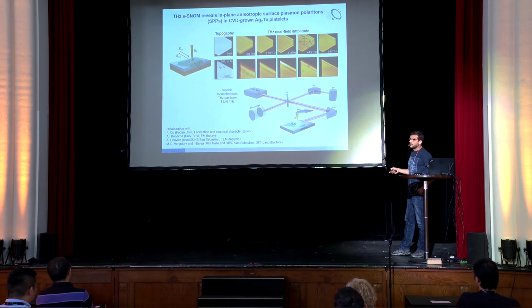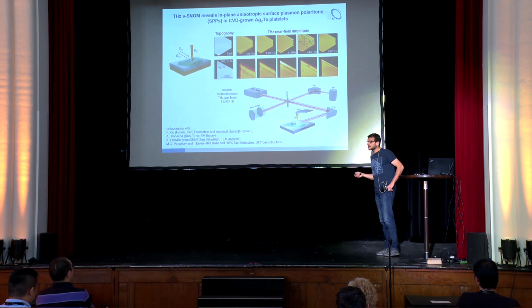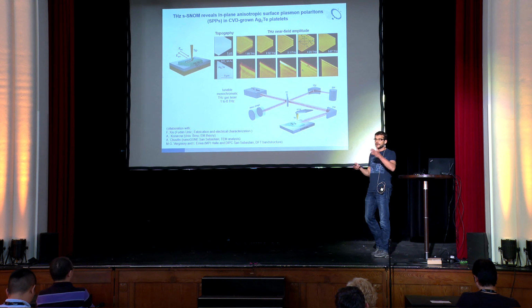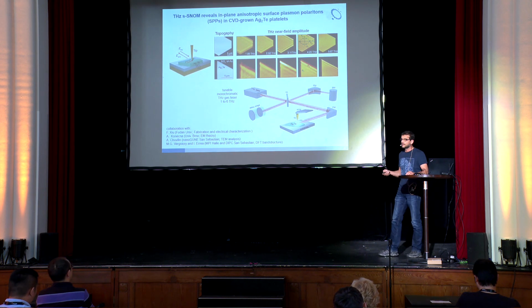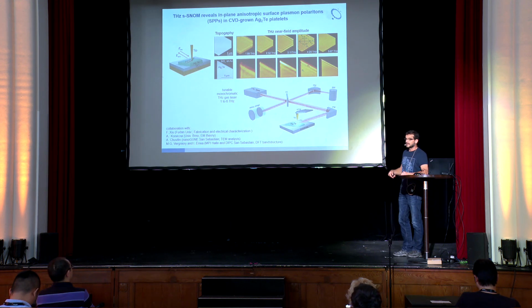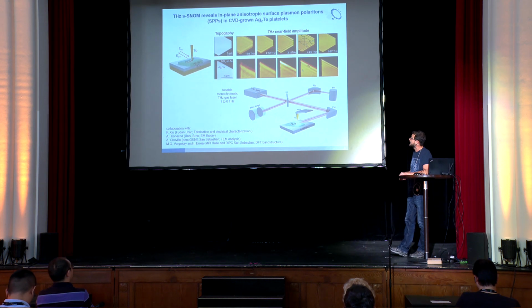And then we use interferometric detection as usual, but we operate it in synthetic holography mode. If you're interested, there are some papers on that. As also Miriam mentioned, they're also measuring in this synthetic holography mode. Because at terahertz frequencies, pseudo-heterodyne is a little bit more tricky because the mirror vibration amplitude would be, well, in the range of 20% of the wavelength. And if we operate with 100 micrometer, that's huge amplitudes. So here we just have the stage. While scanning, we just let it linearly run. And then we get kind of synthetic holograms, which by digital holography processing, we can turn into amplitude and phase images. But I don't want to talk about that.